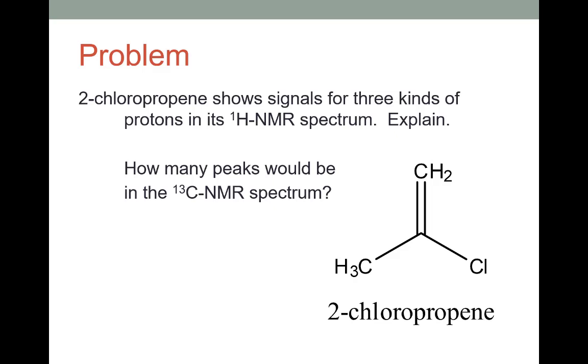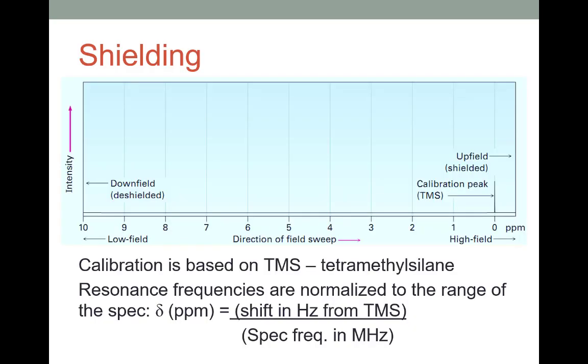The problems in the homework are asking about concept. So what should you expect to see? I want to move forward into looking at actual spectra. So again, I mentioned all of this language before.